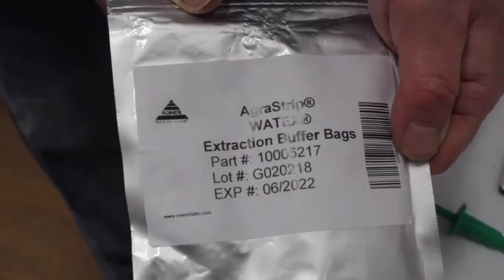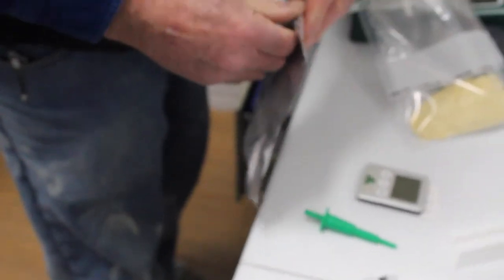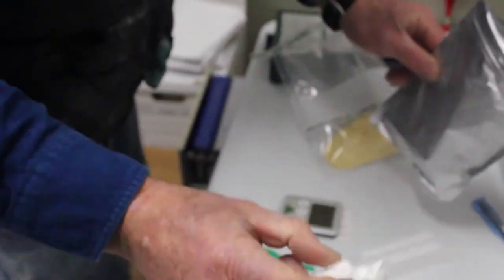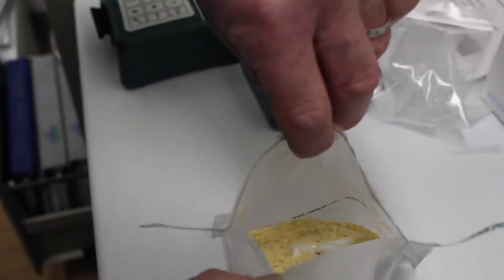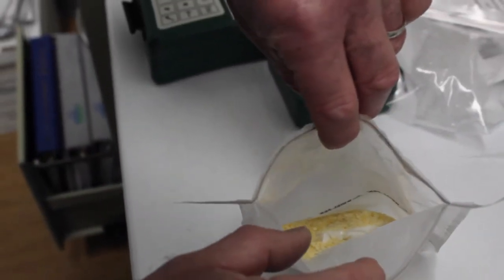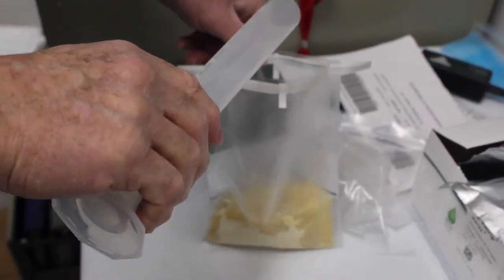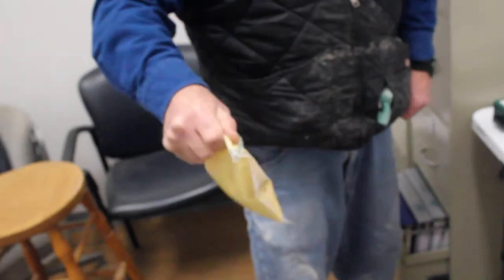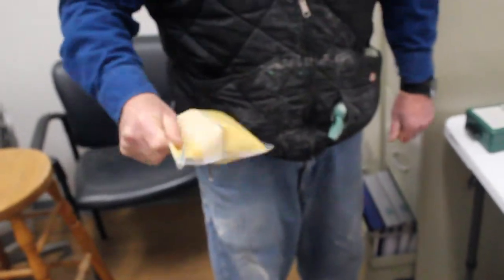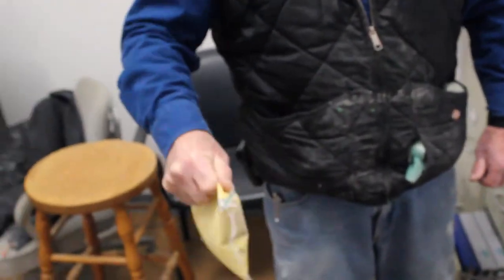Then a buffer bag, which is a packet of chemical, is placed in the filter bag along with the ground corn. They then add a specific amount of distilled water to the bag. The mixture is shaken for about two minutes to dissolve that buffer packet, then the mixture has to rest for an additional two minutes.